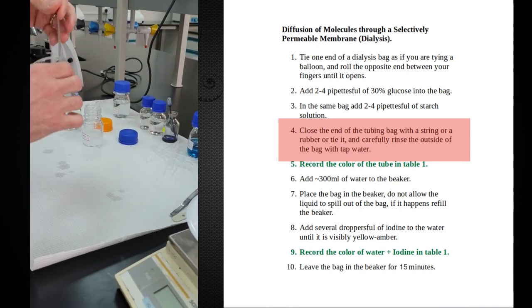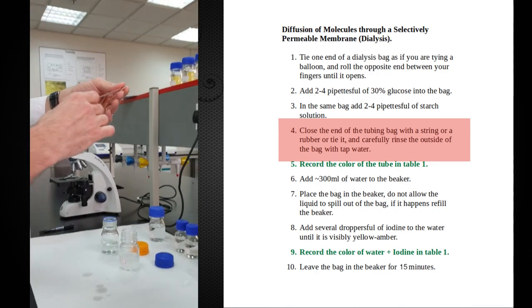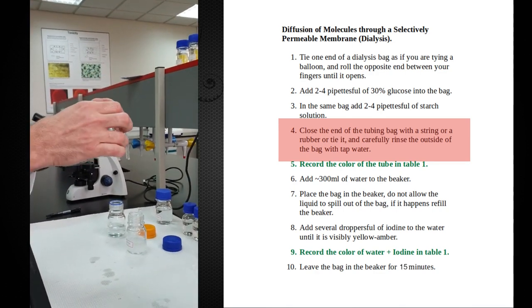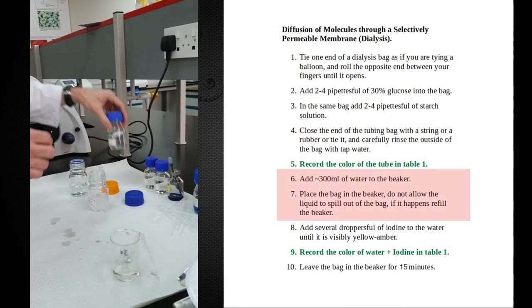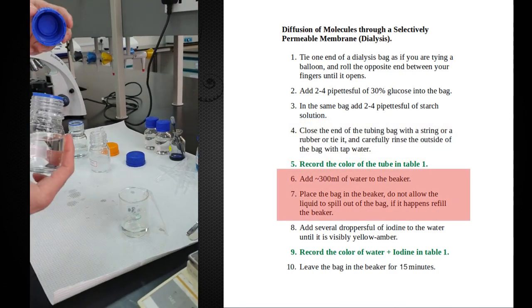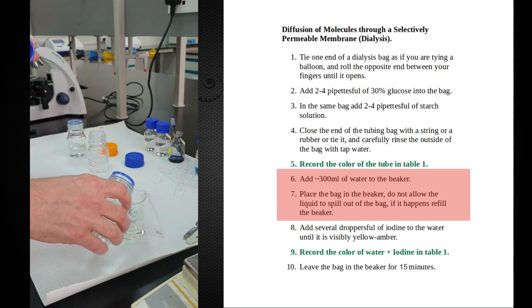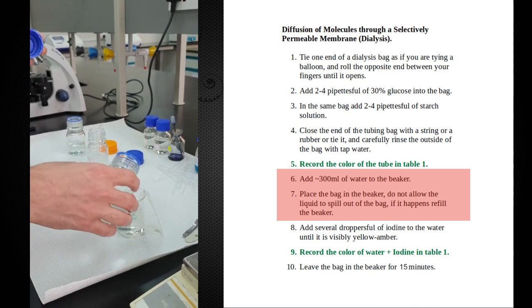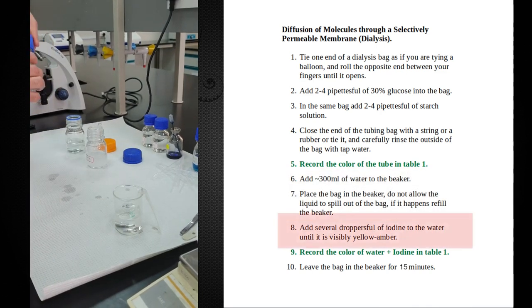Now, some labs have fancy clamps that you can put on to close these things. We don't have any of those, so we're just going to fold it over the side. And we're going to add some water to this that we know is pure water, so it doesn't have any starch or glucose in it.